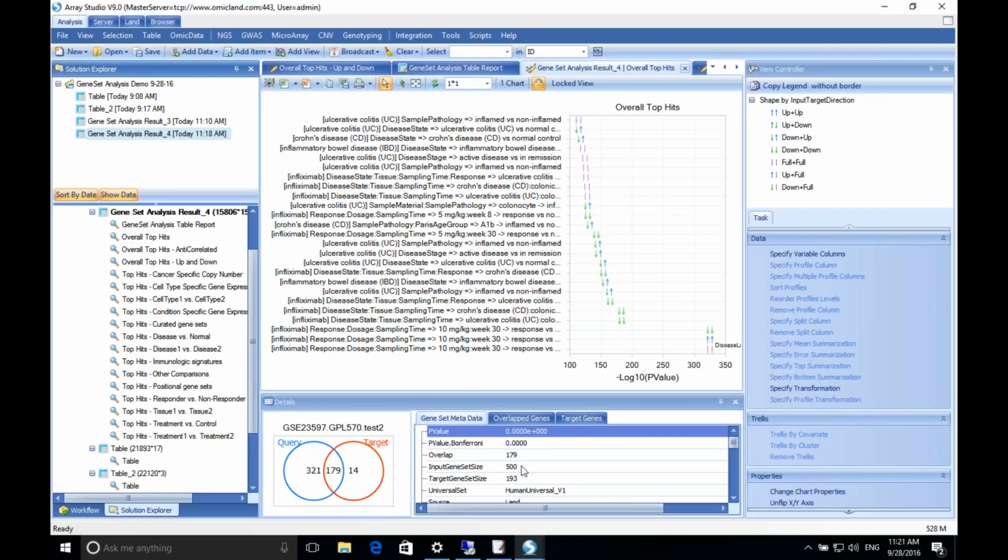I see there were a couple of questions. Where could I find these predefined gene sets from the disease experiments, these particular ones? They're only contained inside the GeneSet analysis, but I can provide you details of how we've done it. There's been some straight filtering that we've done, and there's a max number of genes that are included in each gene set. And then on top of that, we do some calculations in order to figure out what the best size is for the gene set.